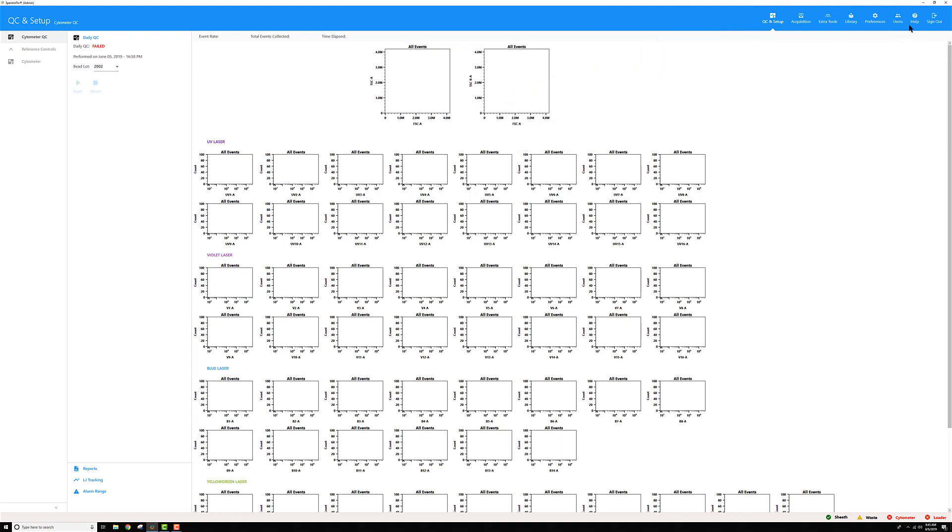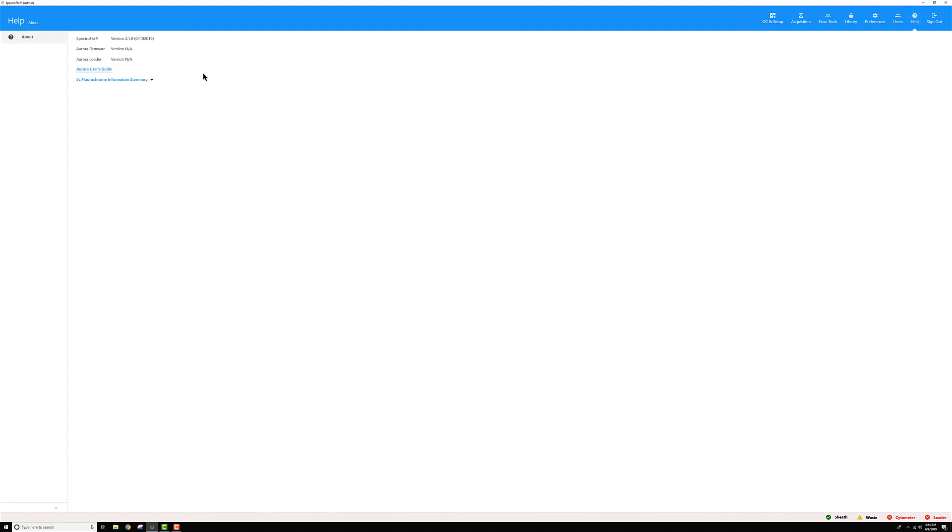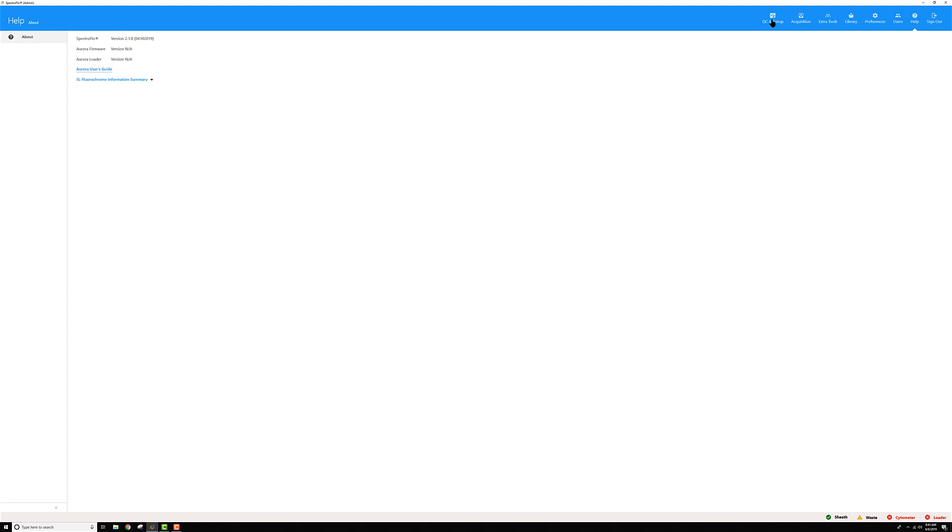We also have a help section as well that now shows, and in the help section, that's where you can go and see what version of the software you're running or check out our user guide or fluorochrome information summary. But alas, I want to go back to QC and setup.